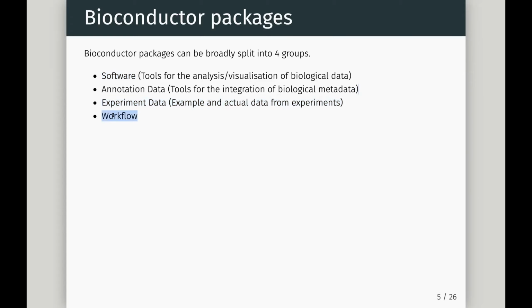The last thing they have, and I think this is a really lovely addition, but going slow in Bioconductor, is their workflows. So they have workflows which really talk you through how you would do an analysis using a combination of software and annotation, and maybe by using some experimental data. So this is really what puts it all together, and this is really the learning aspect, right? Workflows.